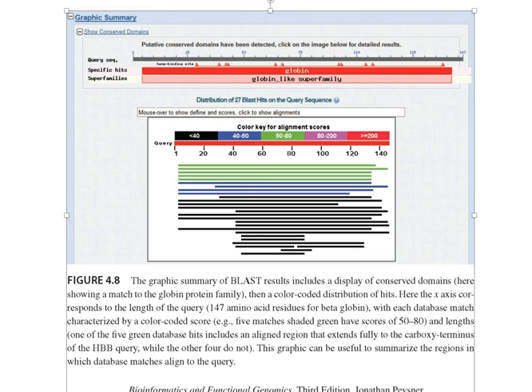I'm picking up where we left off, where you can see the query sequence up here. You can see that you actually have a specific hit, and this is the sort of gestalt or general feel for the distribution of 27 blast hits on a query sequence. You can actually see the decreasing specificity where each of these codes means something. This is to help you understand when you get that graphical response, you have a feel for the number of things that look like they might be interesting to look at.